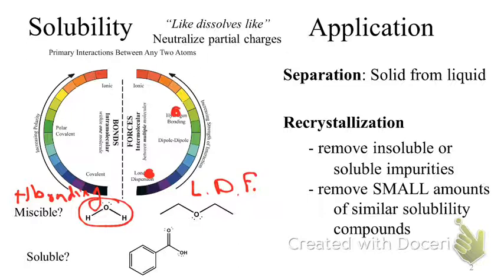Okay? As far as the lab goes, you can predict, and now you go into lab and see what actually happens. And when you move into lab, you find out that those, for all intents and purposes, are insoluble. They don't mix very well at all. Okay? So now we can make it even more difficult and add yet another substance. Let's take a look at benzoic acid.